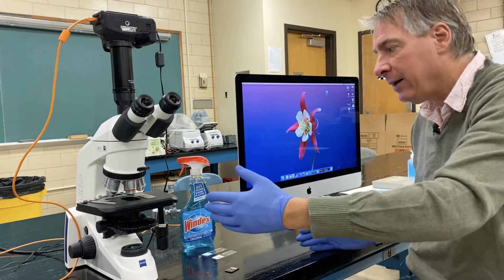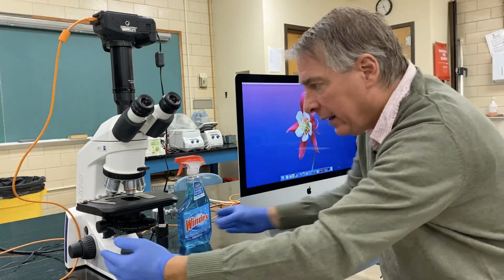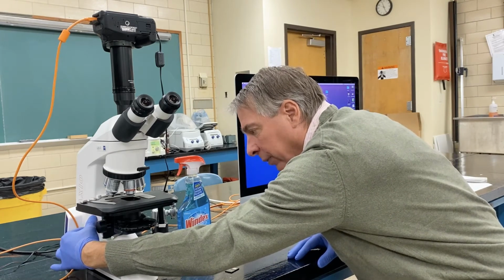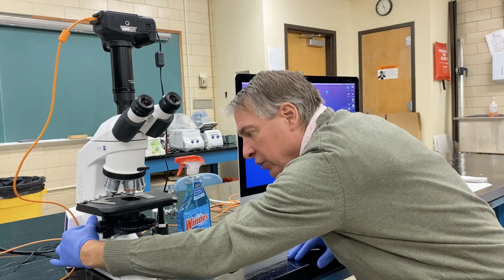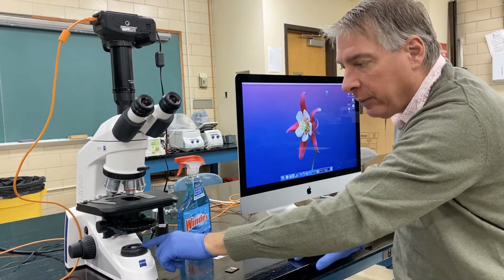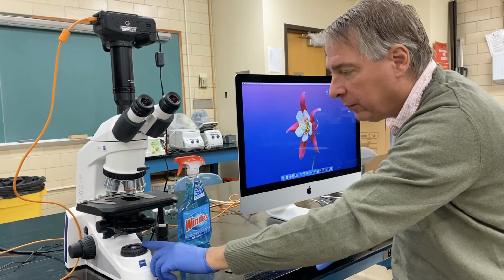Then we need to turn on the microscope, and the power button is on the left-hand side in the back. It's a toggle button, and if you toggle the switch up, it turns the microscope on, and you can see some light coming from the light bulb in the base of the microscope.